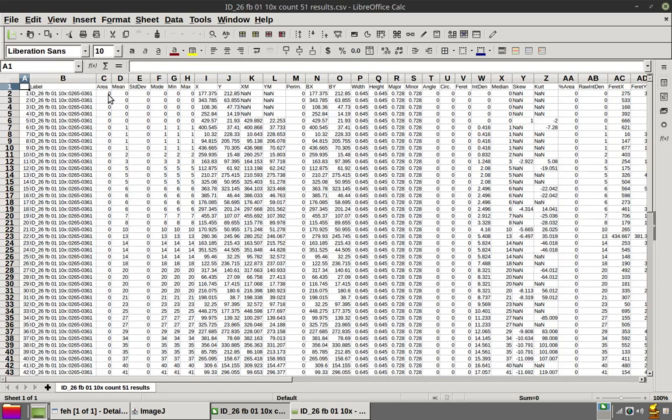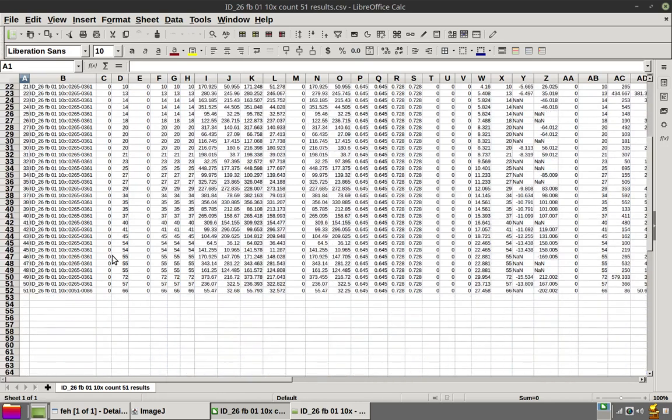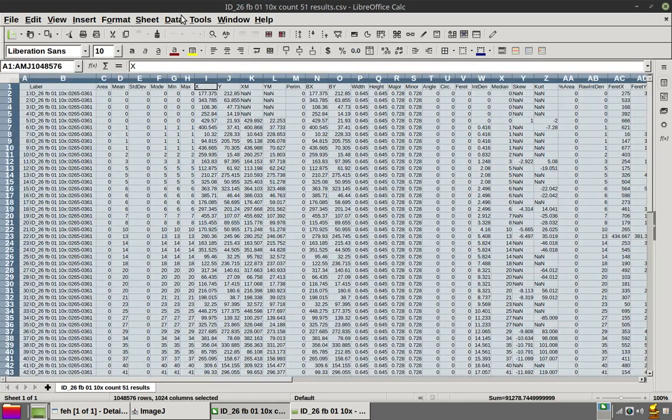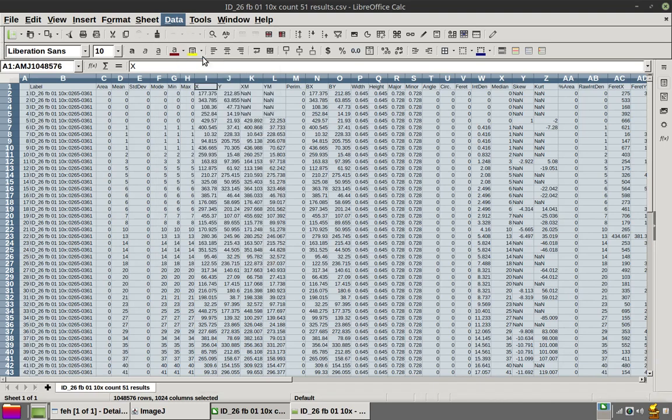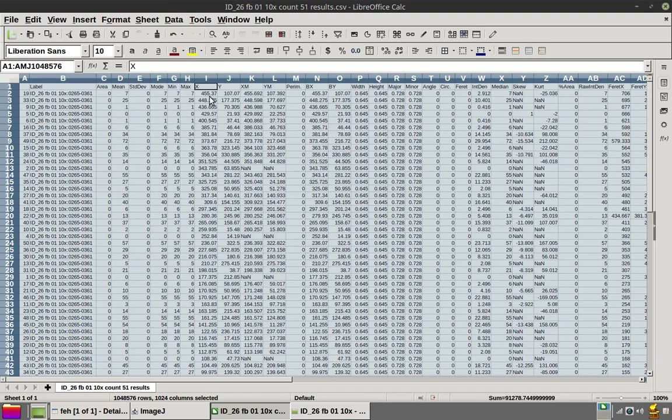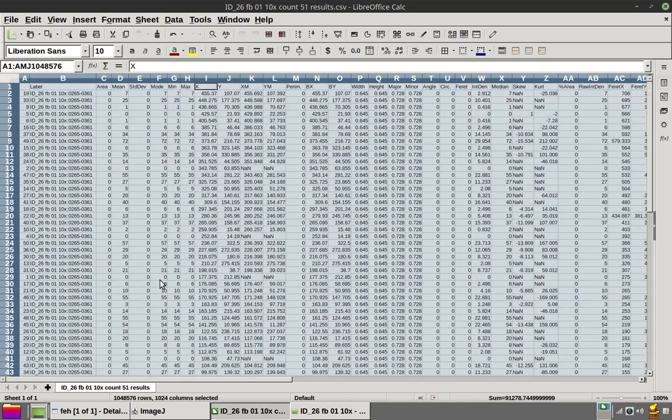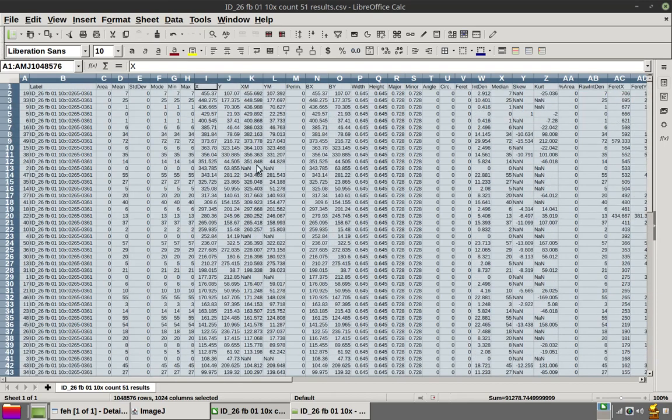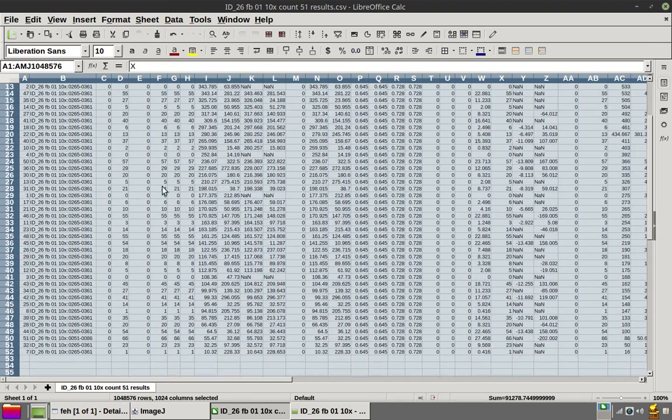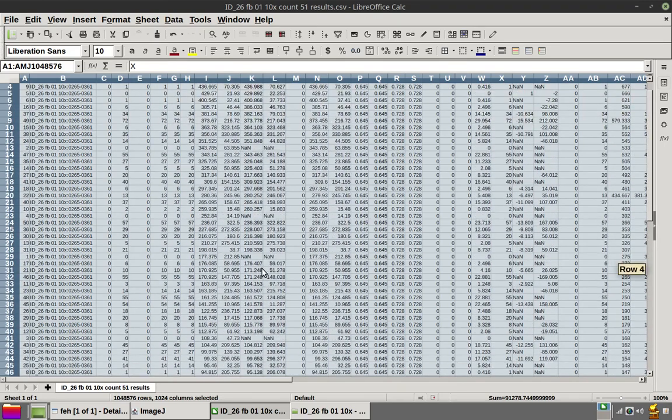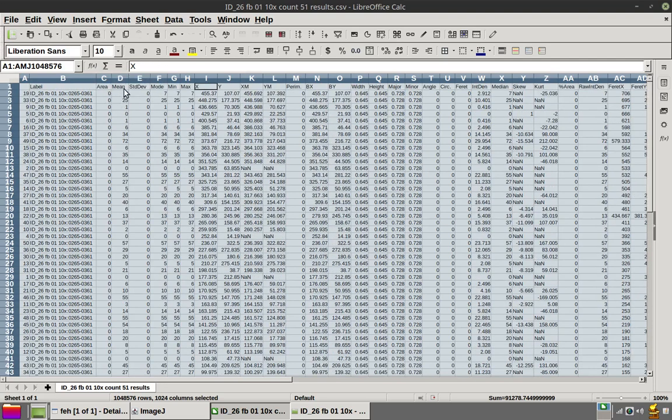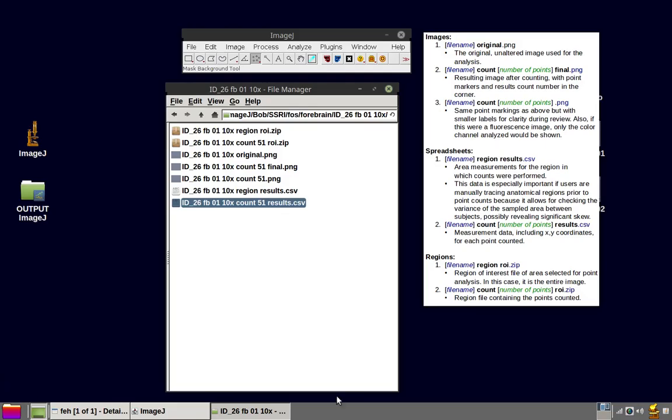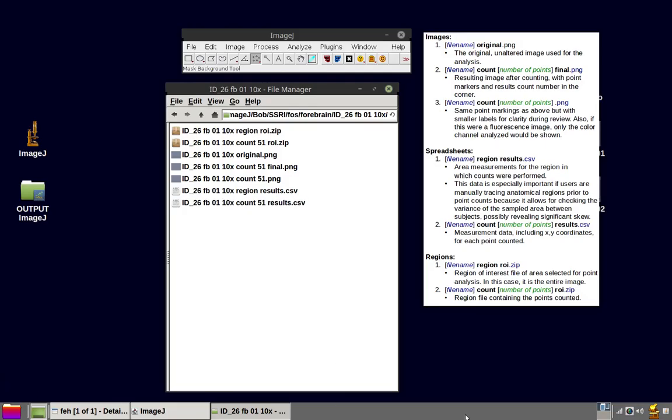This is currently being sorted by area. But if we were to sort this by the x-axis, the values begin to seem more plausible in terms of mean.